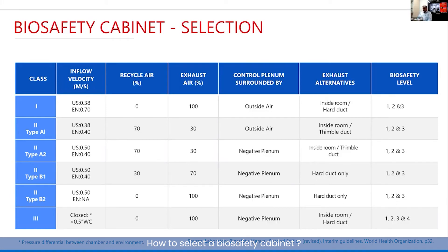What is more popular is Class 2 Type A2, Type B1, and Type B2, where you have 70 percent recycled for A2, 30 percent for B1, and 0 percent for B2. In all these cases there is a negative plenum around, so if there is any breach or contaminant it gets pulled out. For A2 the exhaust air stays inside the room after HEPA filtration, but for B1 and B2 it must be exhausted outside the room via an external exhaust system.